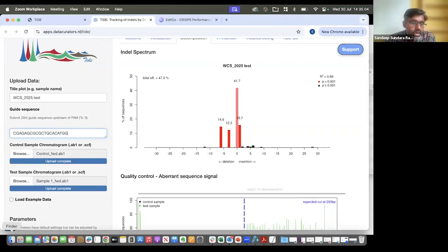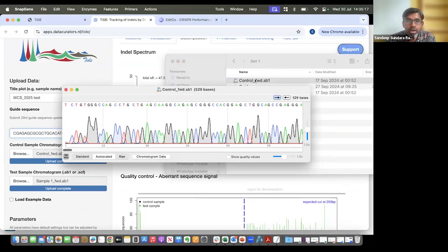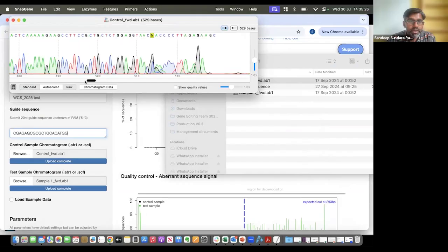So for Kayani, you wanted to know how you can determine what substitutions there are. You've got programs, as Shalini mentioned, that can show this, but that is set 1 that I've looked into. If I open these trace files using SnapGene, what you would find is a sequence read, as I've shown you in my slide. So you've got a very good read of DNA sequence from your PCR product.